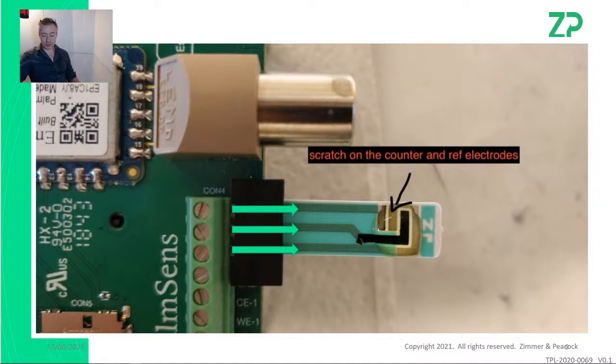I'm going to answer the question that came in to us: why is it darkening here? And it's really good actually, because the reason it darkens here, just out of interest, is that this is the counter electrode. So in a 3 electrode mode, no current goes through the reference electrode, so it's remained more or less untouched. The counter electrode's gone dark. Now I'm going to answer why it's gone dark.